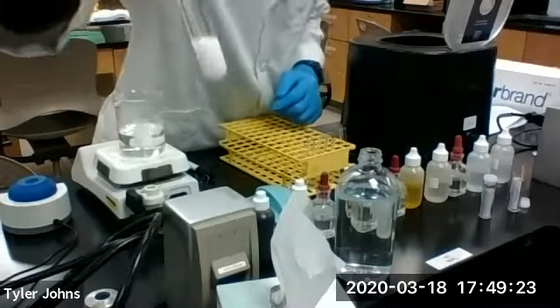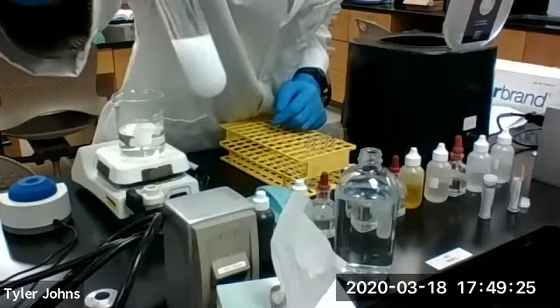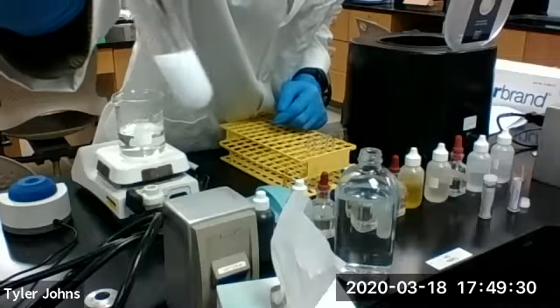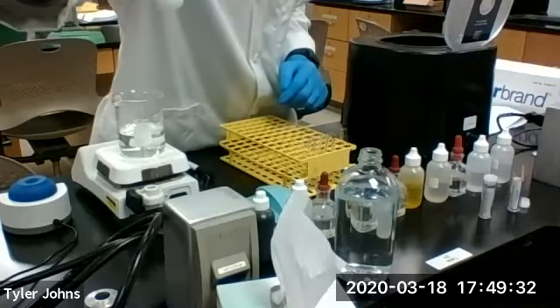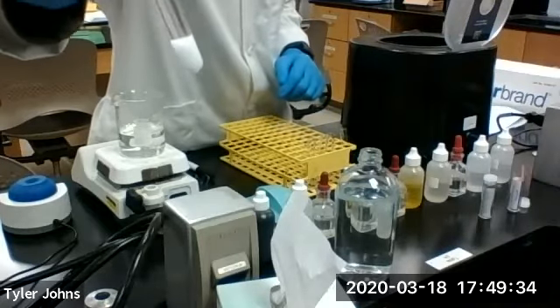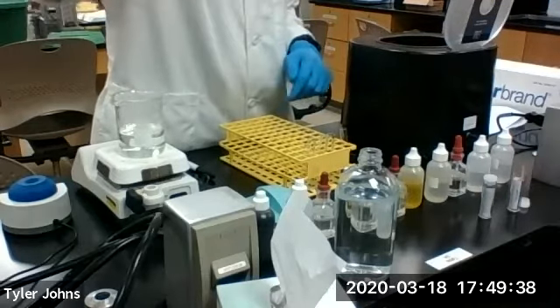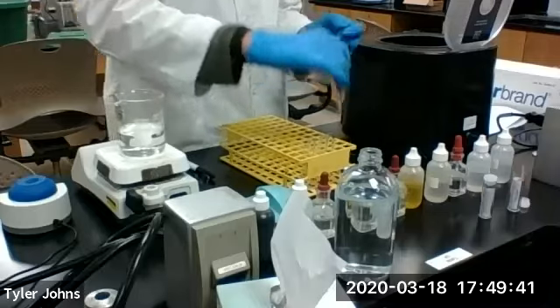As you can see, we have our precipitate of magnesium ammonium phosphate hexahydrate. That's a confirmation of our magnesium ion. However, to further confirm the test of the magnesium ion, we're going to centrifuge this.